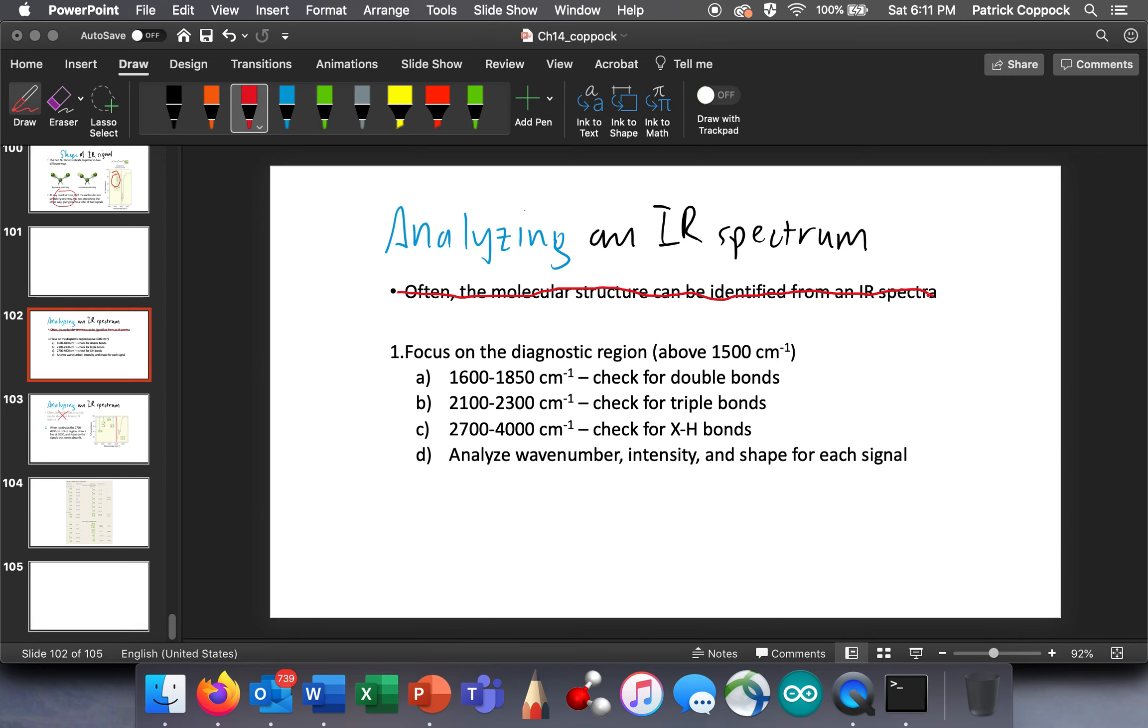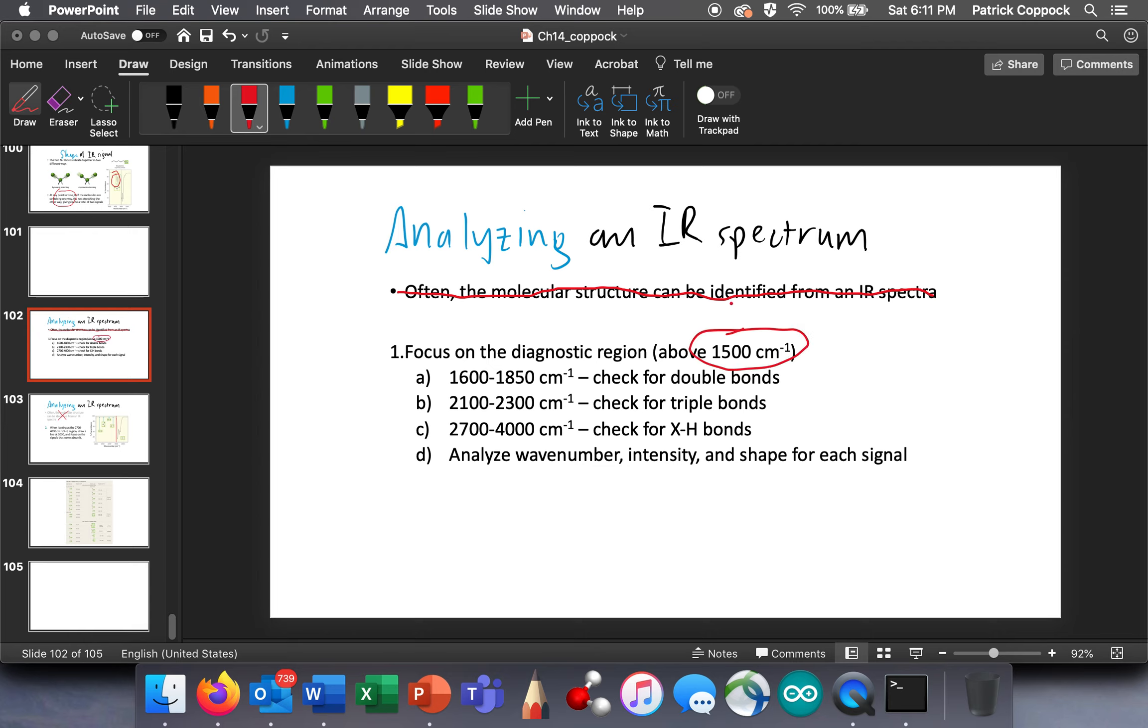So you really need to relax. I mentioned that. It's not just a throwaway comment. I want you to know that we are going to take IR spectra, we're going to look for information in it, and there's going to be some stuff in it that we can't even get, like the fingerprint region. First of all, I want you to focus on the diagnostic region that is above 1500. Below is the fingerprint region.